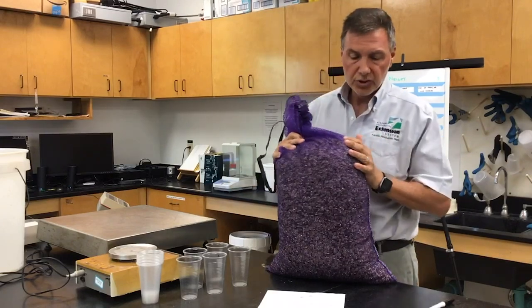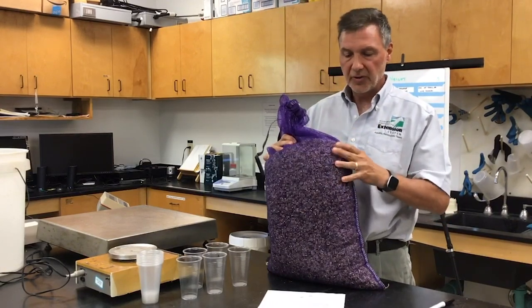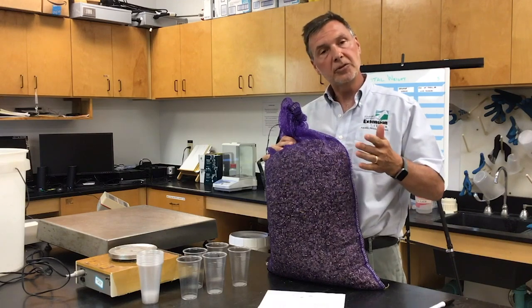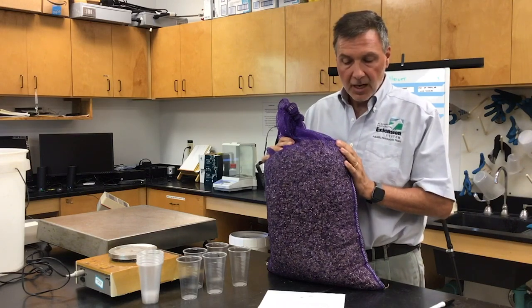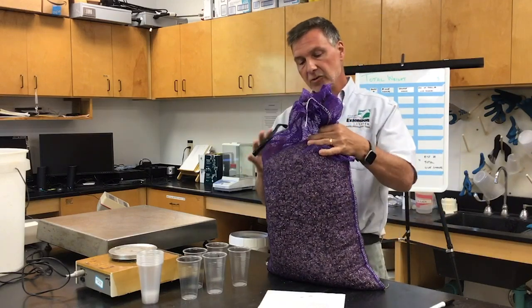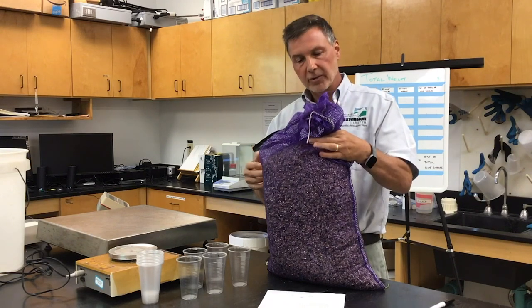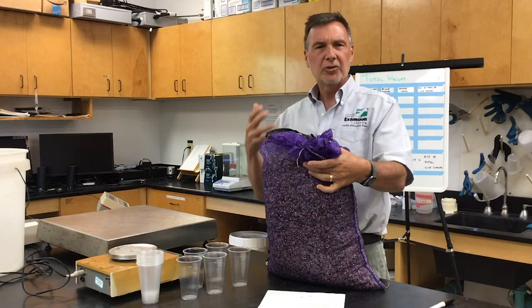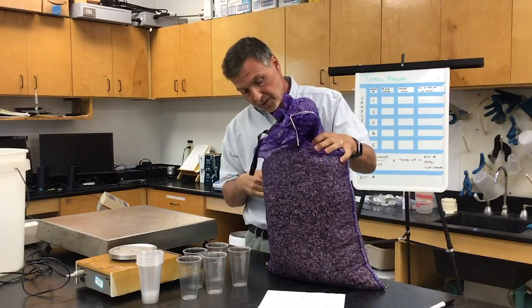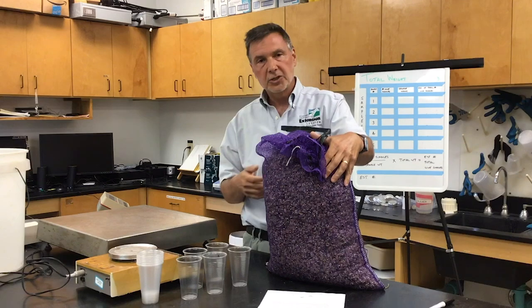There are also some decisions you're going to have to make before you start. What are you counting? Are you counting live singles? What are you going to do with doubles or triples? We only count live singles, but you would want to check with your seed supplier to see how they handled that — did they count doubles as one or as two? You also want to think about how many samples you want to take. If the seed are very well sorted and all about the same size, you can get away with fewer samples. If you have a mix of sizes, that increases variability and you'll want more subsamples. We really recommend using the metric system because the multiplication is so much simpler.